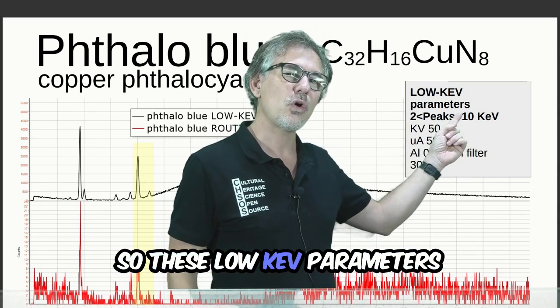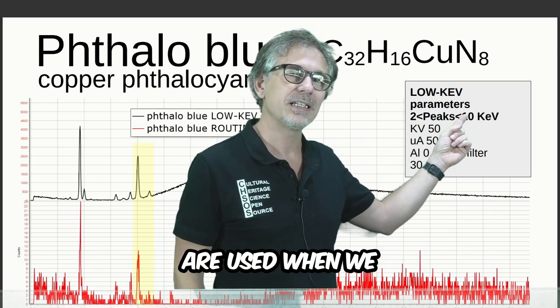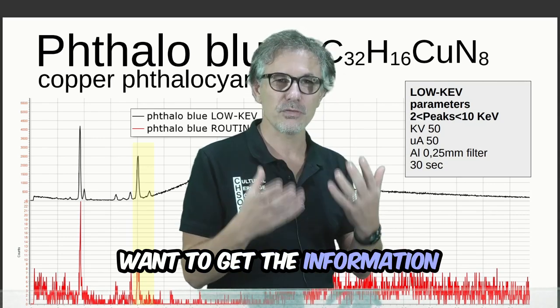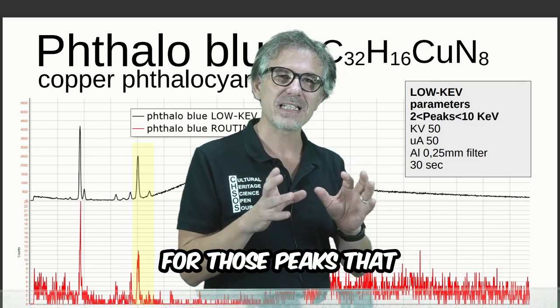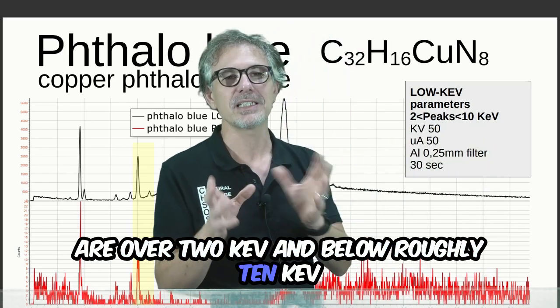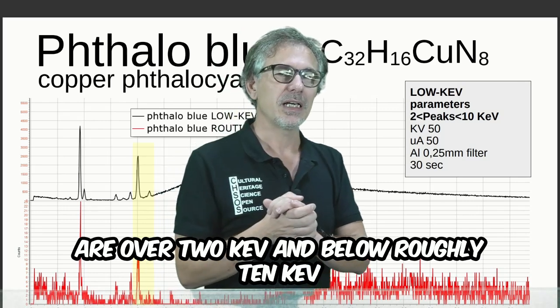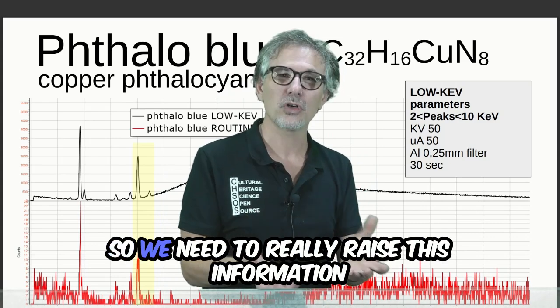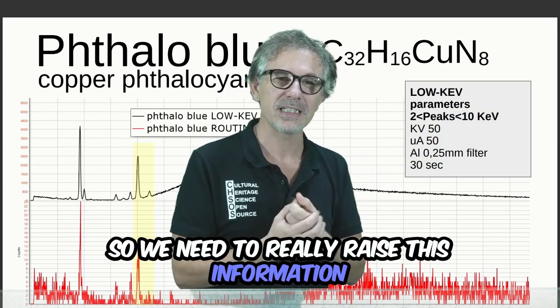These low keV parameters are used when we want to get information for peaks roughly between 2 keV and 10 keV, for elements that are in low concentration, so we need to really raise this information.